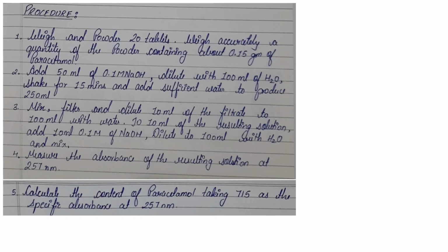Hello everyone. So this is the procedure for the determination of content of paracetamol by absorptivity method. This procedure is according to the IP. Now if you see here, the first sentence is weigh and powder 20 tablets.